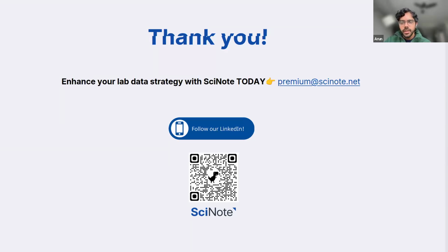Tess, I guess a question for you. In your past experience, did you ever have any instruments connected to SciNote directly? Sort of. What we ended up doing, which included the SciNote API, is we had different instruments that had their own computers producing data. That data was looked at by the scientist who was in charge of those instruments, then got uploaded to SciNote.